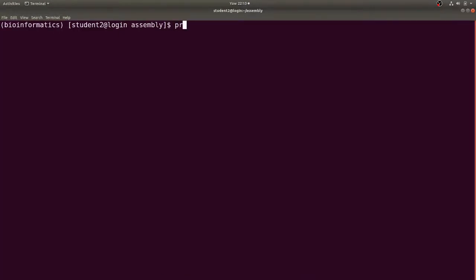To do the annotation, I type prokka. I specify my prefix. I'm using MA25. I specify my locus tag, which should be in lower caps. I also give it the same MA25, but you can change it. It's all about your preferences. For CPUs, my server has over 20 CPUs, so I'll specify 24. Kingdom is bacteria.